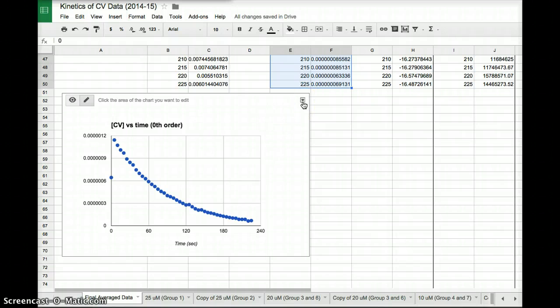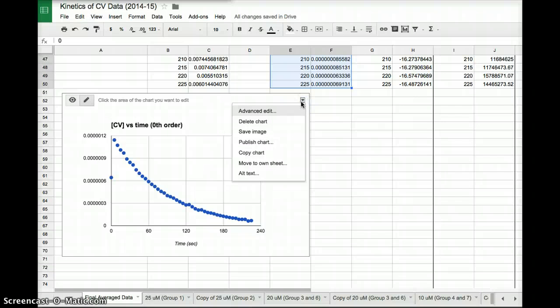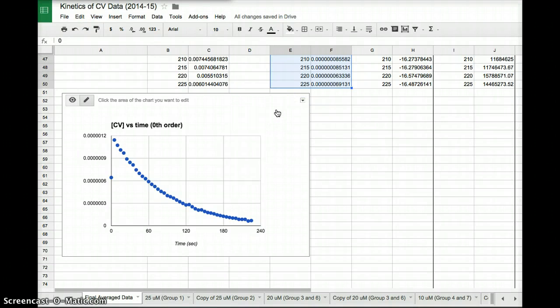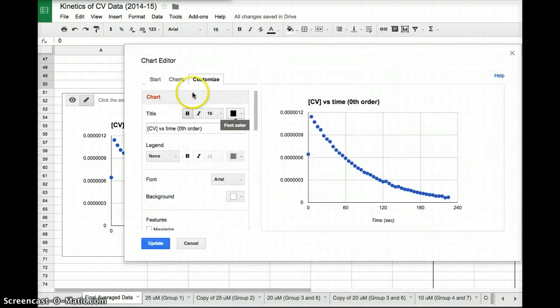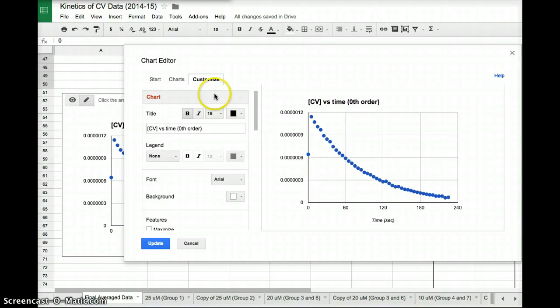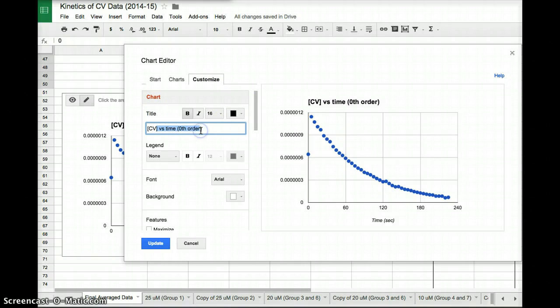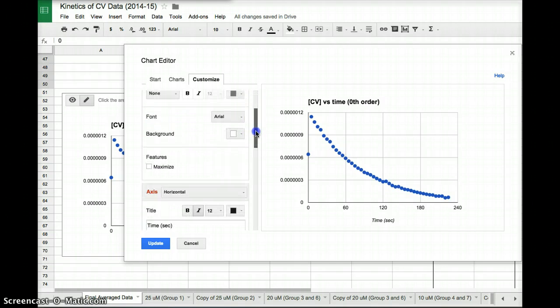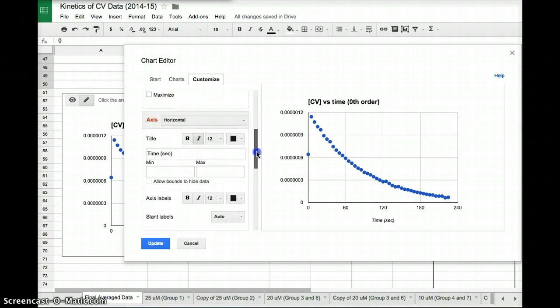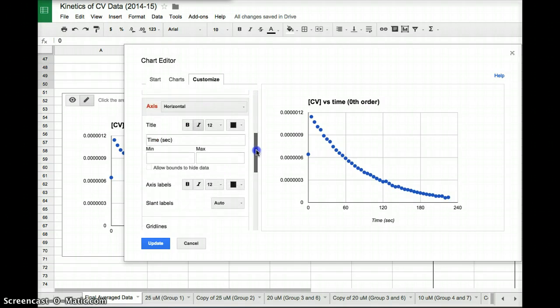This little triangle in the top right corner is going to give you everything you need. So I click on this, and I go to advanced edit. Now what I can do under customize is I can change the name. So you can see here title. I could retype the title in if I wanted.